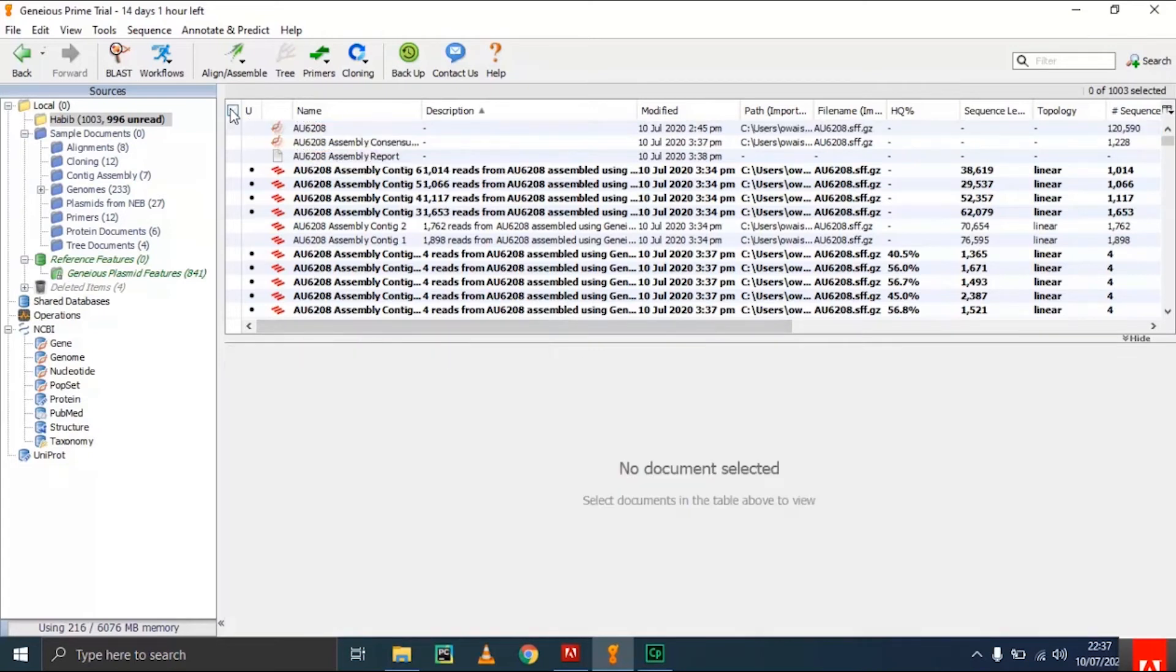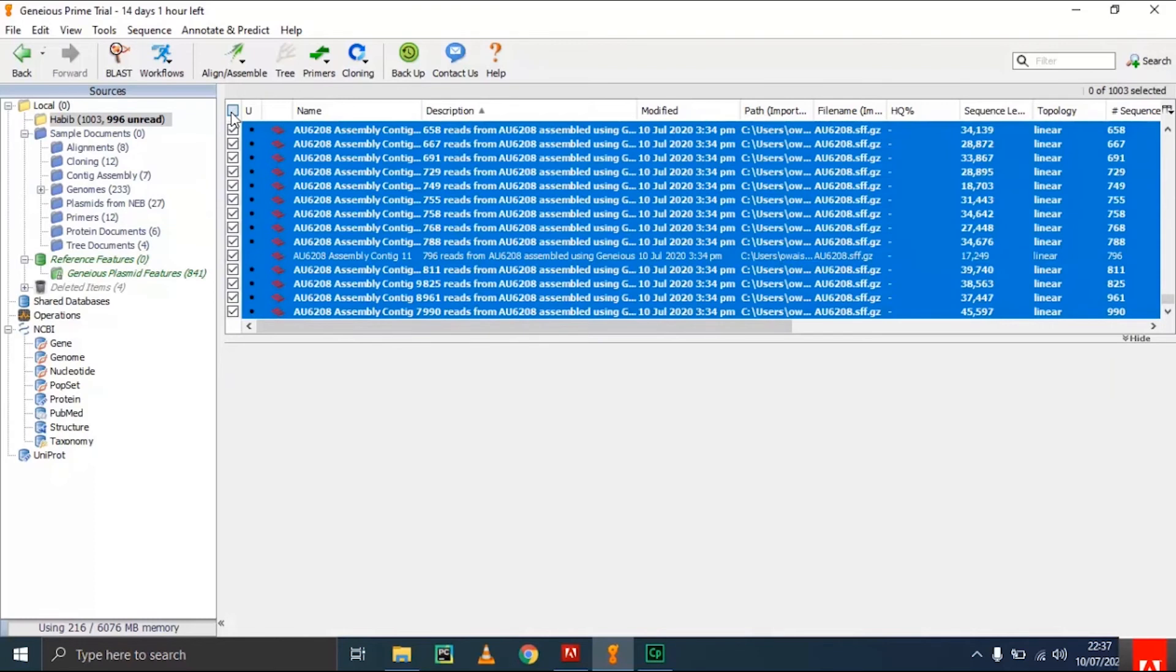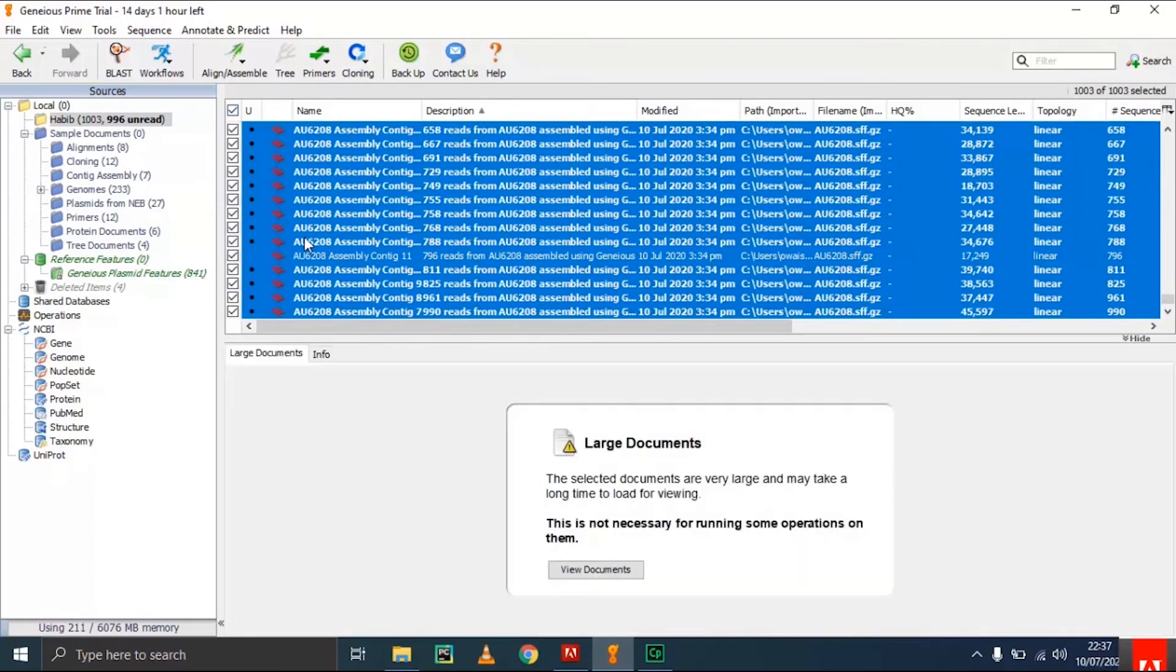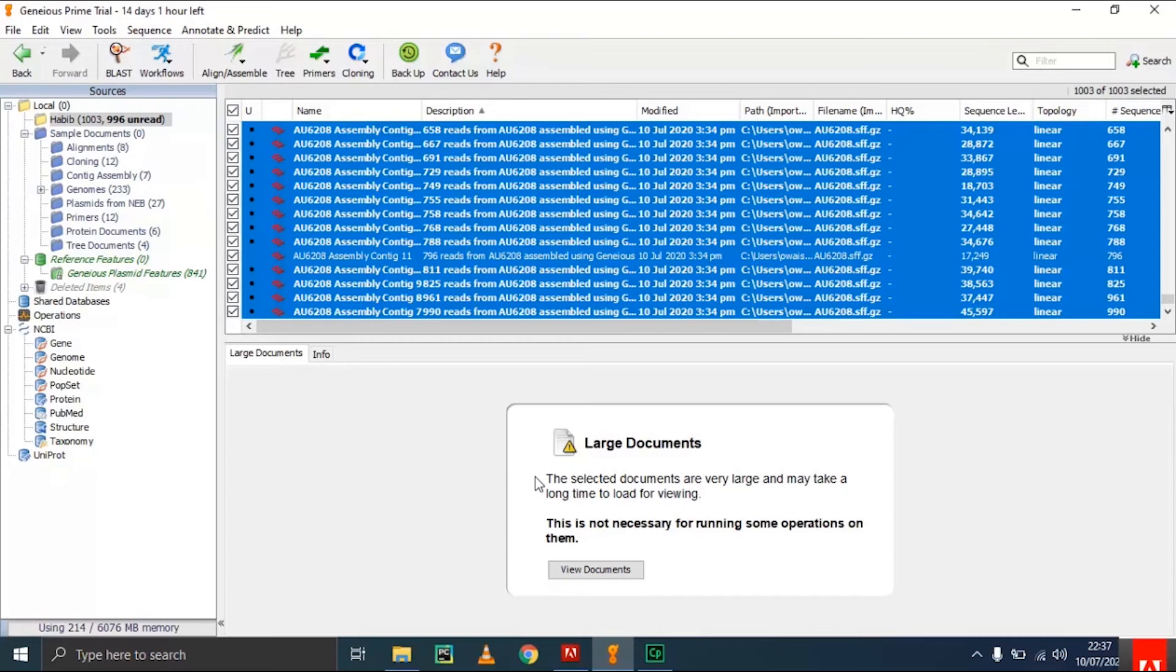If I select all, you can see it's a large document. This is a very large document for performing different operations. I don't recommend running operations on such large datasets as it will take hours or probably hang your system.